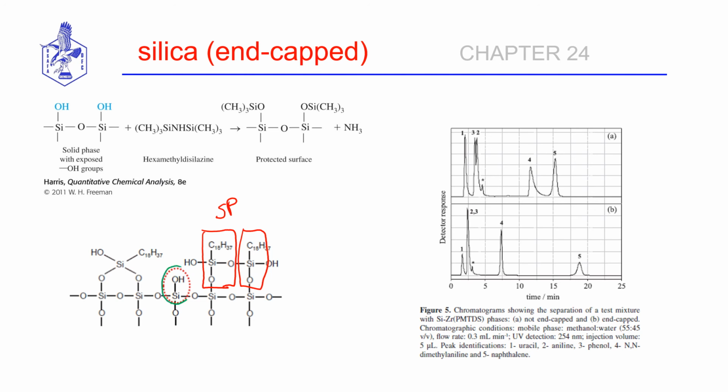all of the silanol sites typically with your stationary phase. Once we have placed a big group like a C18 group on the surface, it's going to be really hard to get another C18 group here. But I probably could come back and react those unreacted silanols with something smaller, like a trimethyl group, and that could sneak in and possibly fit in here better.